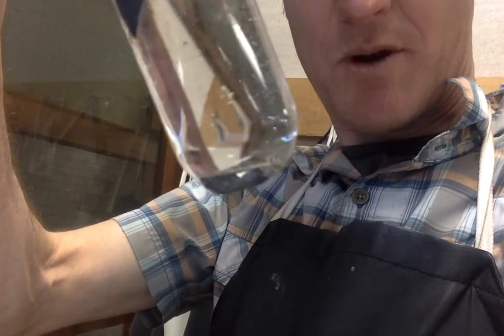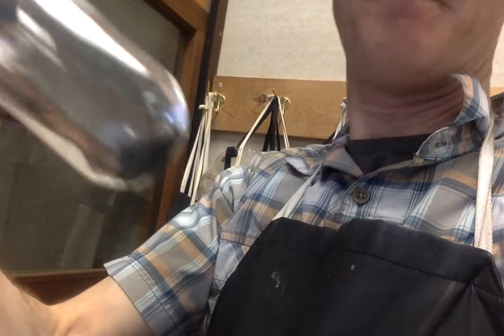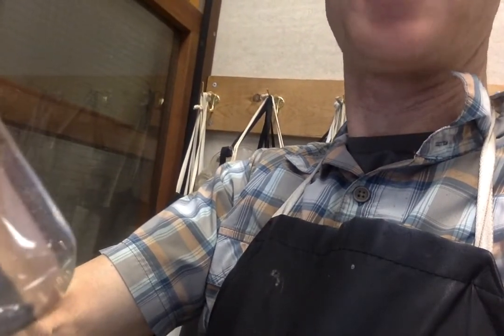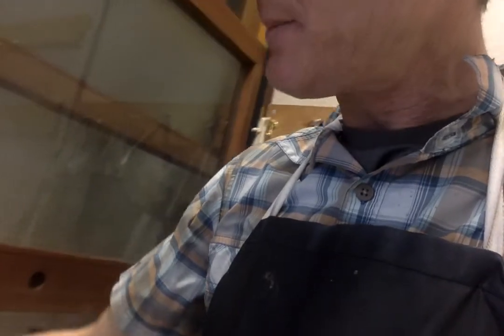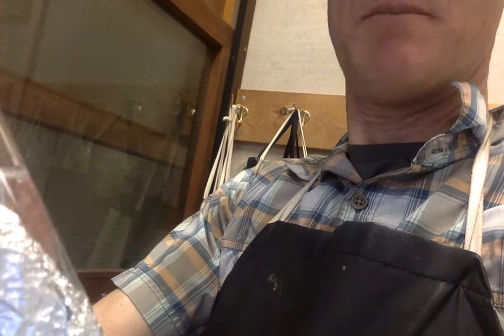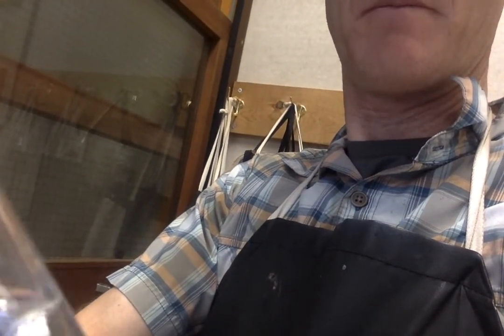Carbon and acid. This is a tricky one. I think it's probably just caught a bubble down here. I would expect to see little bubbles collecting on the surface if there was a real reaction. There's not supposed to be a reaction, but I can't rule out the possibility that there might be one, especially if there's any kind of impurities on the surface of the carbon.